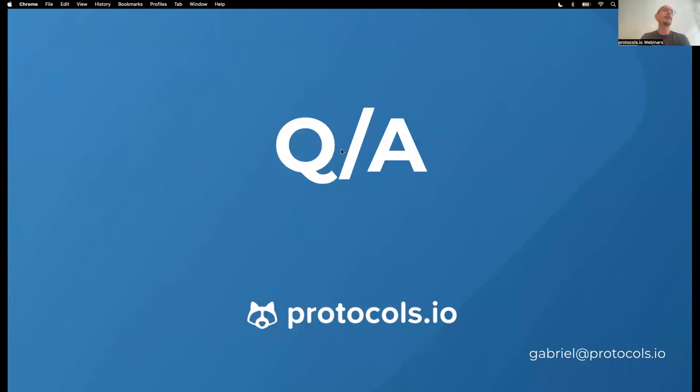So the first question is whether there is an app. No, we don't have an app, but it is easy to open the platform in a tablet or a cell phone as well. And I don't think we have the plan to launch an app in the near future.